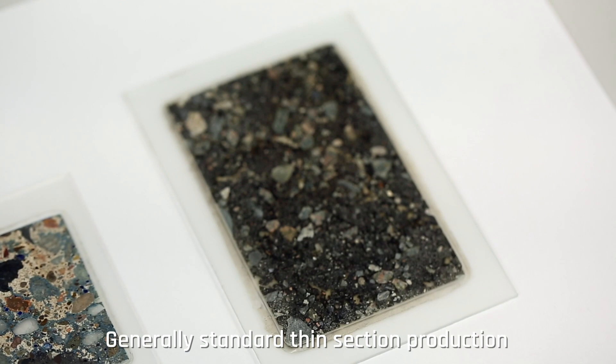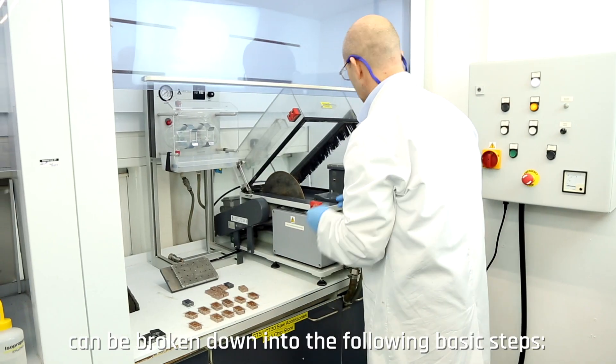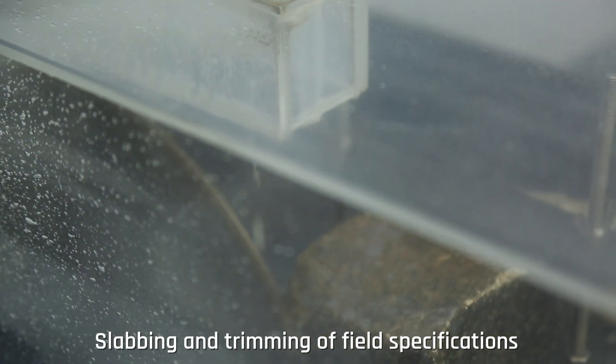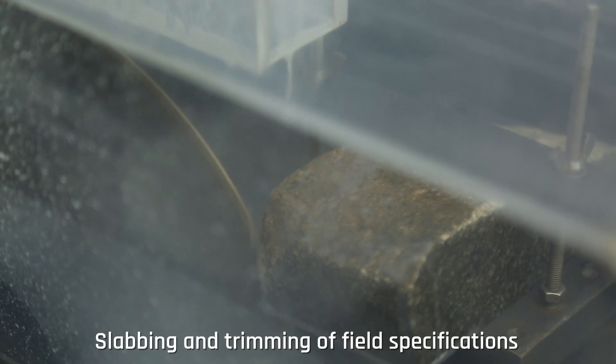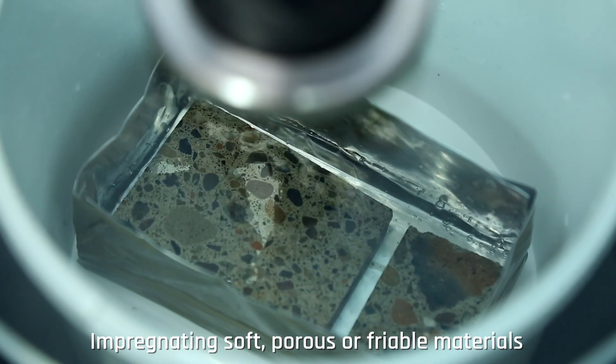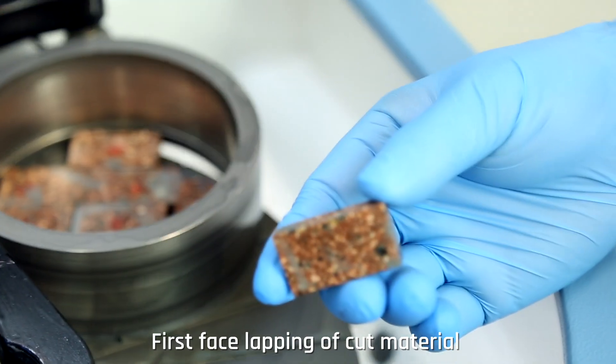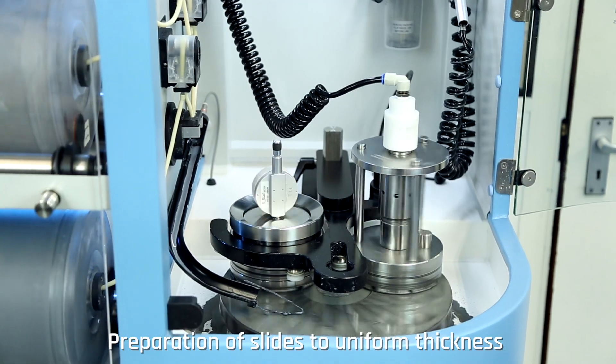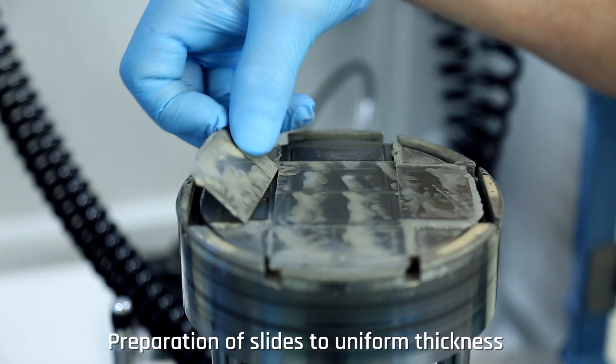Generally, standard thin section production can be broken down into the following basic steps: slabbing and trimming of field specifications, impregnating soft, porous or friable materials, first-face lapping of cut material, and preparation of slides to uniform thickness.